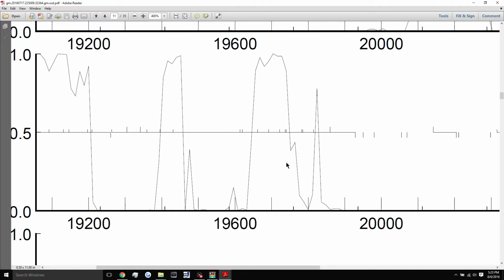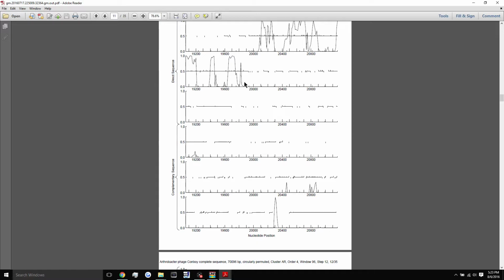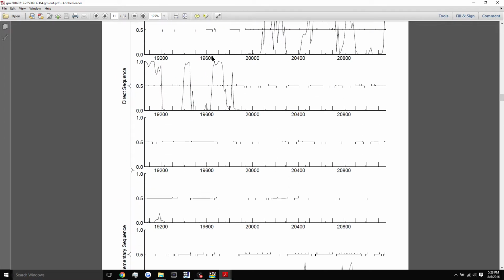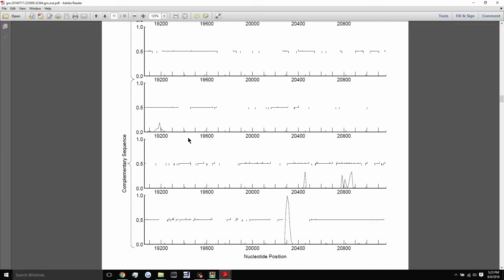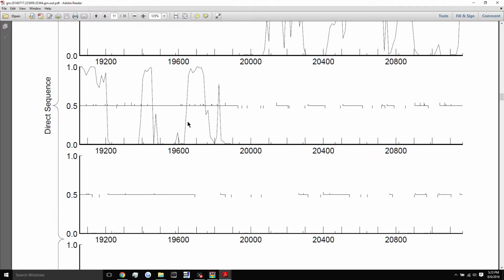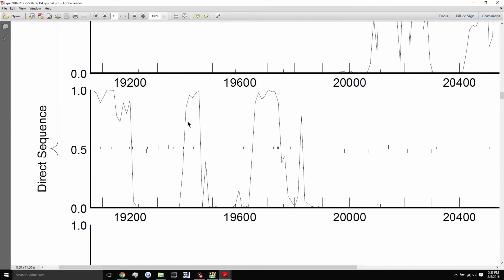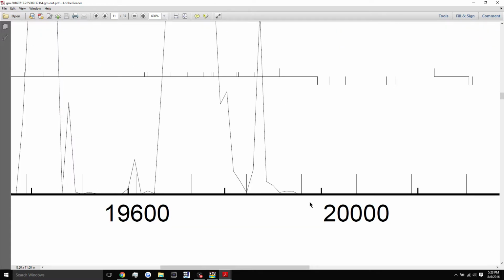Now I'm going to zoom out really quickly. If you don't see any spikes for your start site in any frames, like if they all were blank, you may not have a gene at that location. It may be evidence that the gene reported by those sources when you ran auto annotate were incorrect. But that would just mean you have to do more evidence.